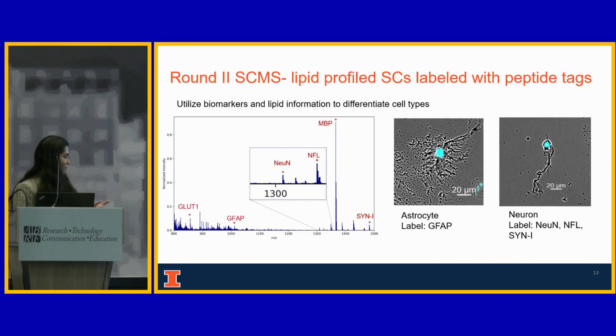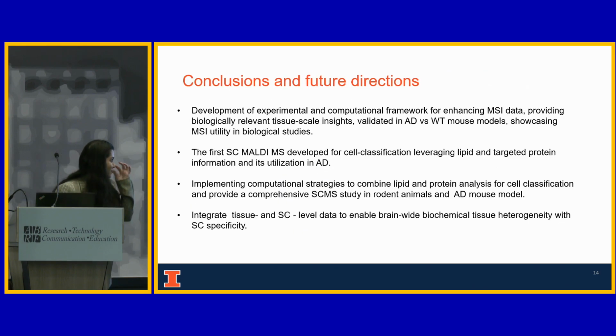So right now, all I'm doing is trying to do single-cell classification just in the neurons in the brain, and also apply that to the Alzheimer's disease model, which I have shown here.